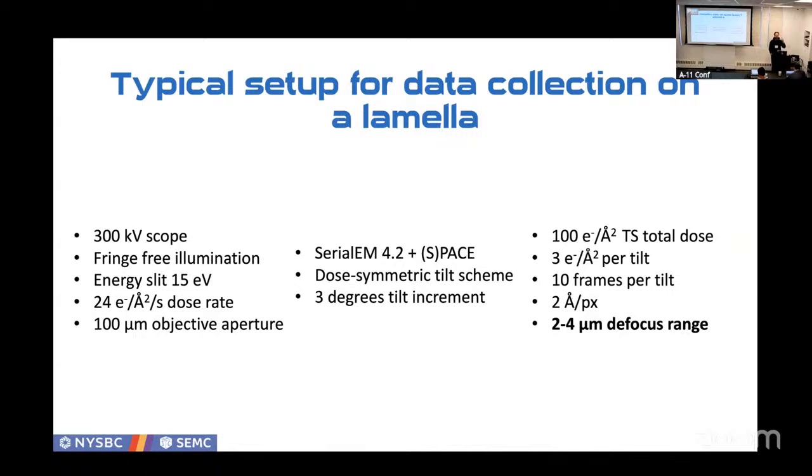For tomography, we wouldn't do patch correction, we do full frame motion correction. So you can get away with a little bit lower dose, but you still need some to correct for the motion drift. We keep about 10 frames for 3 electrons per angstrom squared, which becomes 0.3 electrons per angstrom squared. But since it's a full frame, it's enough information to correct for drift.